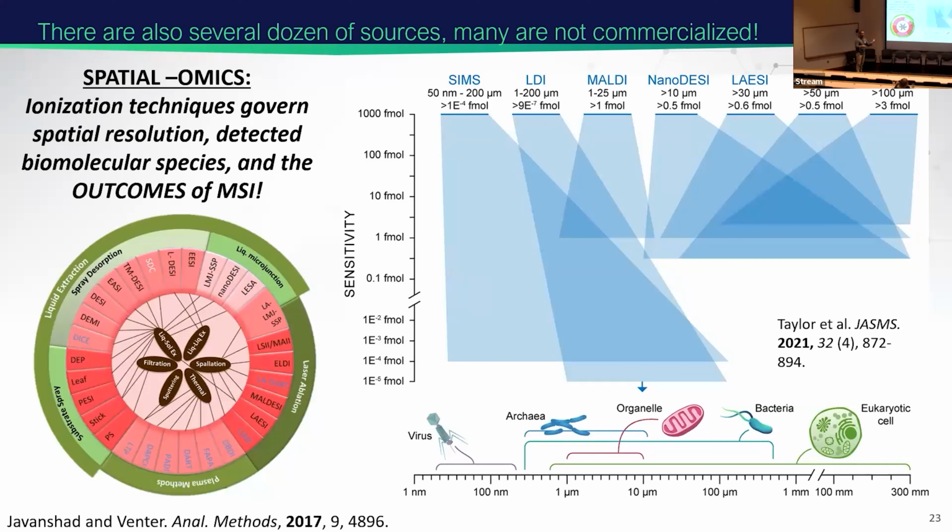The very interesting thing is that it's not the most sensitive technique, but it's so versatile that we can analyze nearly every single biomolecular species directly by MALDI. You can analyze things up to a megadalton directly, but you're limited by your detector. And then there is ambient ionization, which happens outside of vacuum.